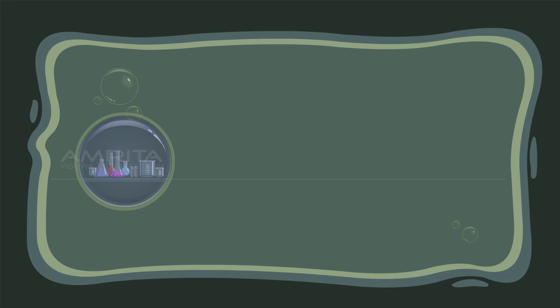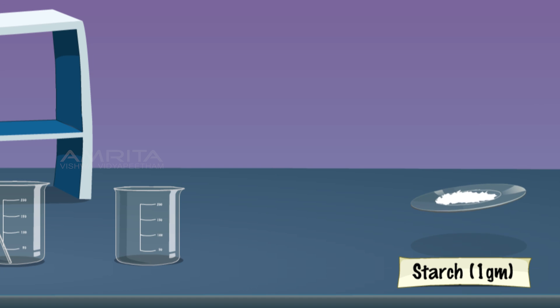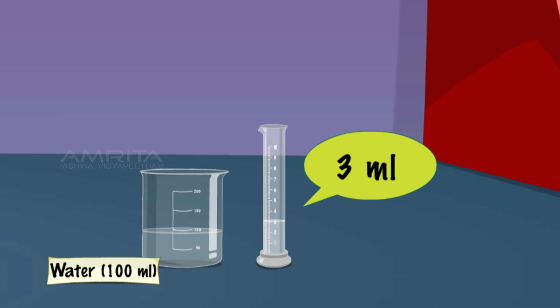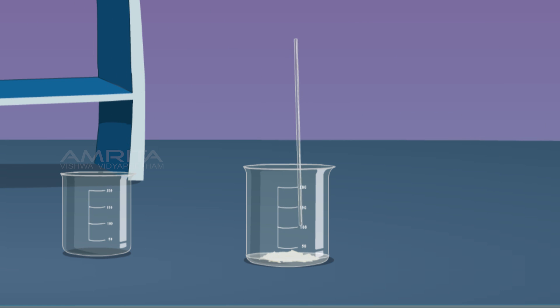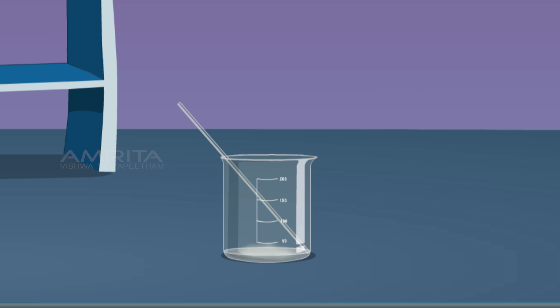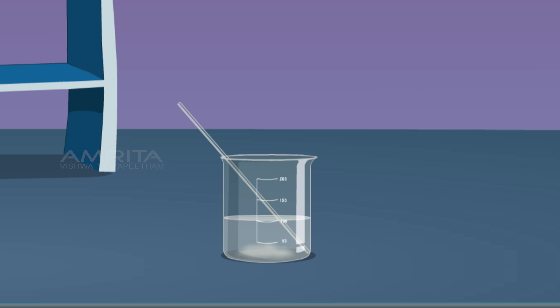Colloids. For the preparation of a colloid of starch in water, take 1g of starch powder in a 250ml beaker. Take 3ml of distilled water from another beaker containing 100ml distilled water and pour it into the beaker containing starch. Mix well using a glass rod. Heat the remaining 97ml of distilled water over a Bunsen burner and pour the boiling water into the starch beaker. Stir well and cool.